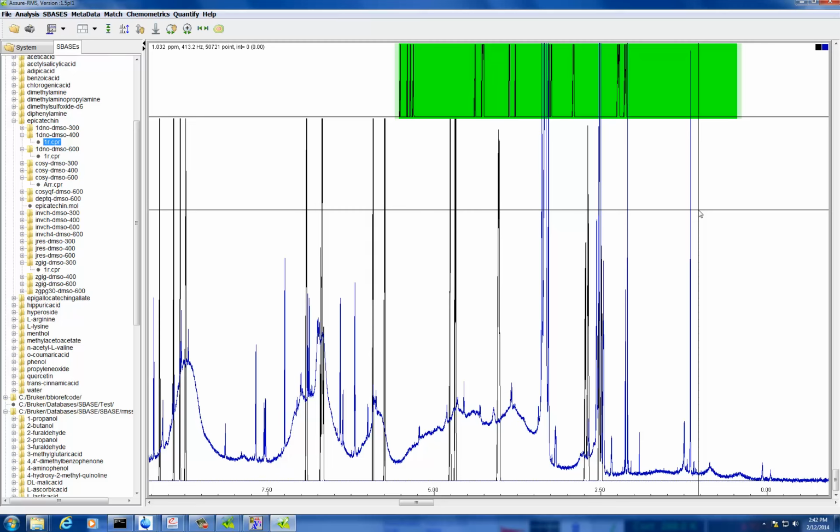So what's the molecular weight cutoff that it would filter out? I wouldn't know the exact number. How big are the PACs? Well, they range, right? The dimers are still probably considered small. Like A2 would be a molecular weight of 576. A trimer, you add 290 to that. Yeah, dimers I think would be fine, trimers around 870, and I think as you go bigger from there, as they get over 1,000, you'll for sure have some larger oligomers, tetramers, pentamers in this sample. Those would be cut out, and then you just basically get sharper lines.